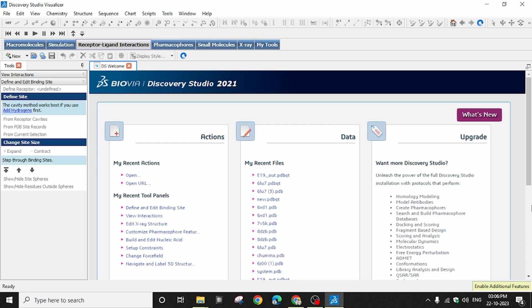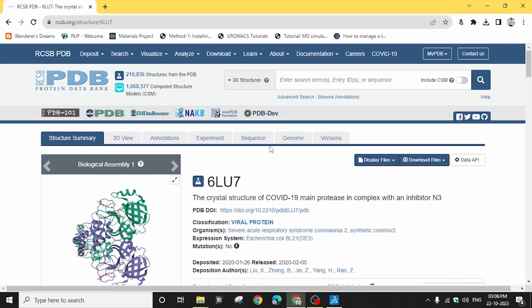The basic steps we follow are: download a structure from a suitable database like PDB for the protein, or design your protein with homology modeling; then download or construct your ligand molecule based on your requirements, and then perform the docking. If you need clarification regarding docking procedures, refer to my other videos. In this video I'll be specifically covering docking result analysis and how to validate your docking.